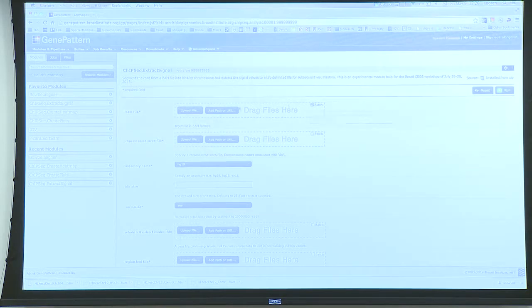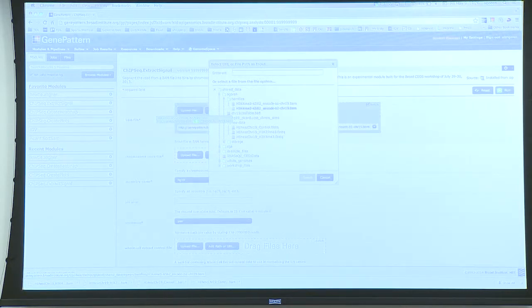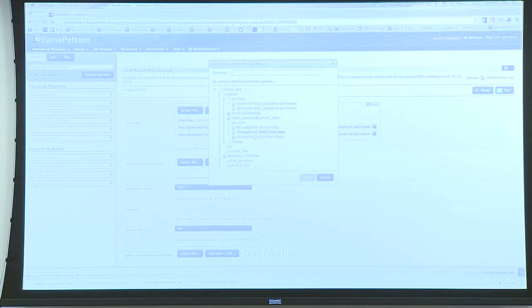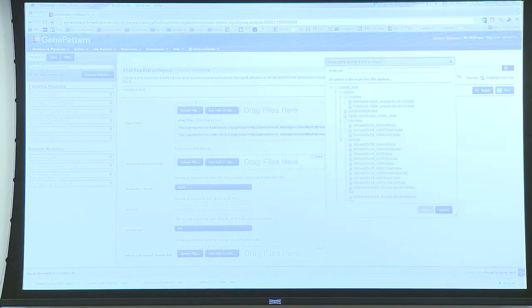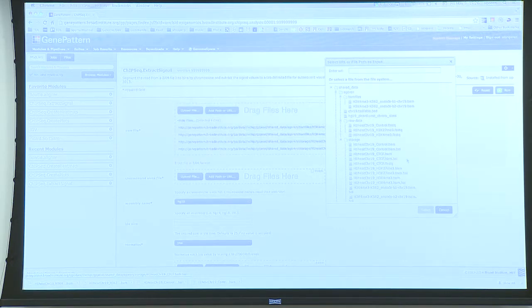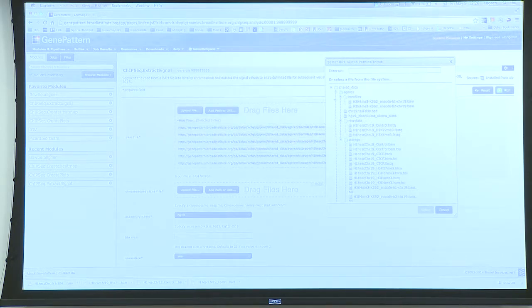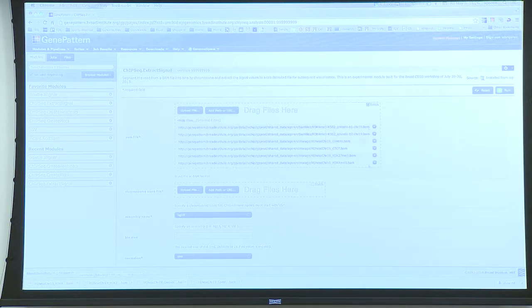Here we do a batch, so let's do it for all of them. We have these BAM files that I put under BAM files. I also made some storage to make it easier on me, so I don't need to look for them before. I have the control BAM. I even have a CTCF that I didn't want you to run so it wouldn't take so long. I have K27, and I have K4ME3. So now I'm doing it for 6 files at once.